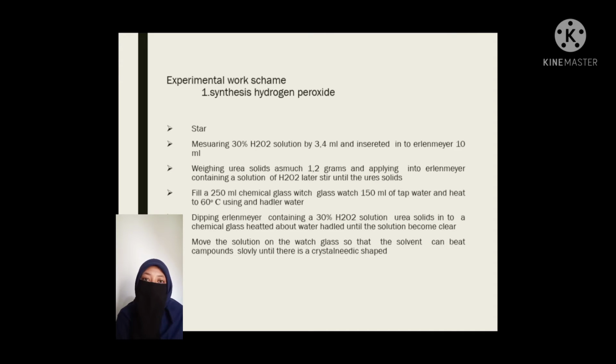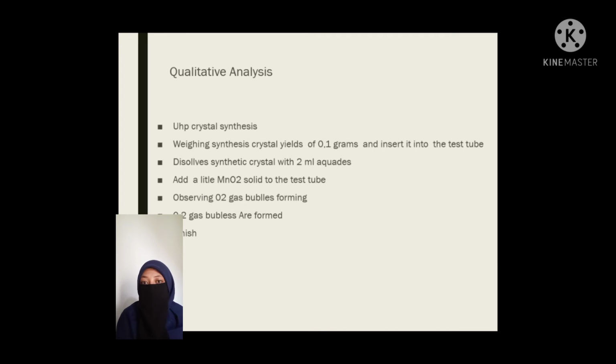Move the solution onto a watch glass so that the solvent can evaporate slowly until crystals form, needle shaped. Synthetic urea crystal. Next to the qualitative analysis.